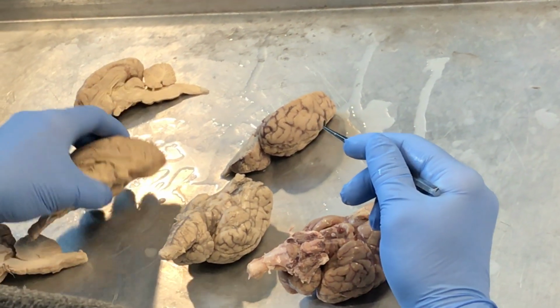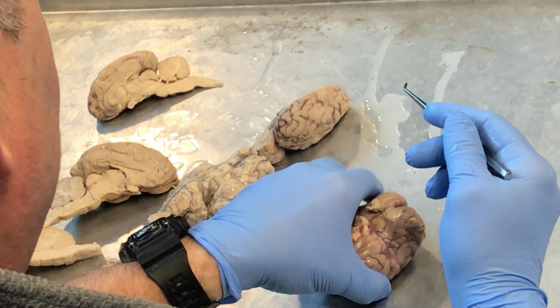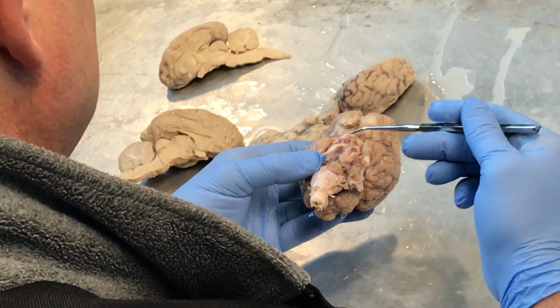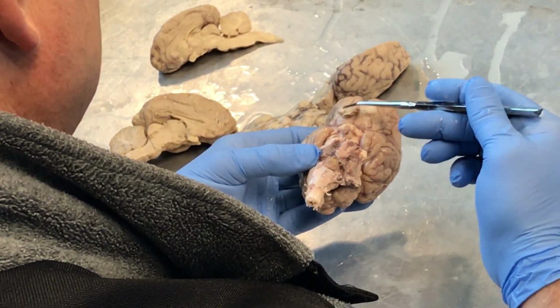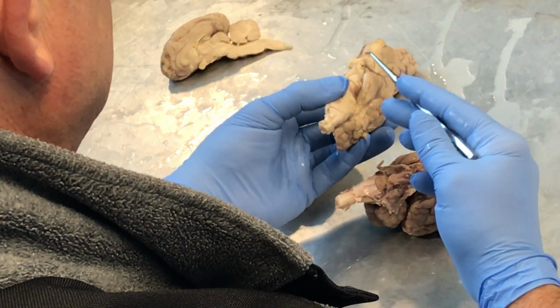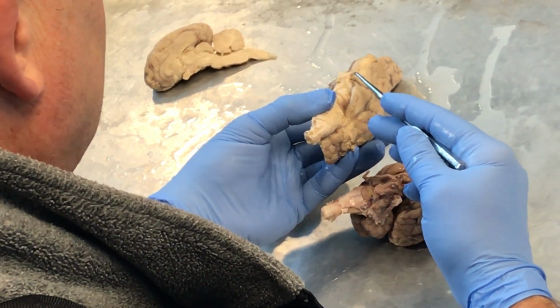Optic nerve. Now, the optic nerve is the nerve for the eyeballs. Now, the problem with these sheep brains is they cut the optic nerve so close to the base of the brain that you don't see the nerves themselves. See if I see a good one. This is a little bit better. You can see the nerve kind of coming off there a little bit.